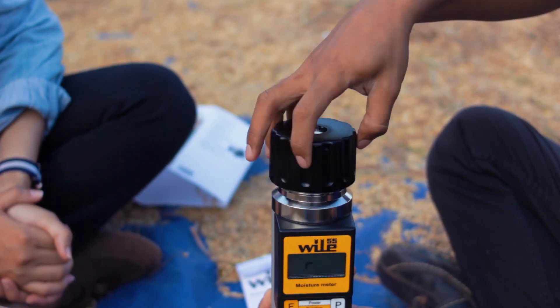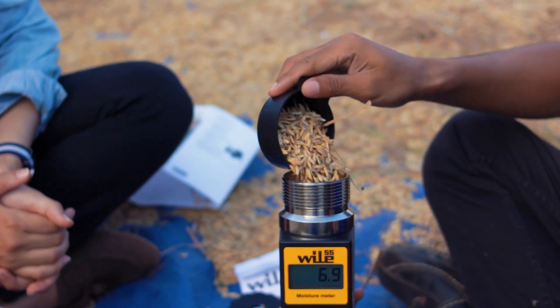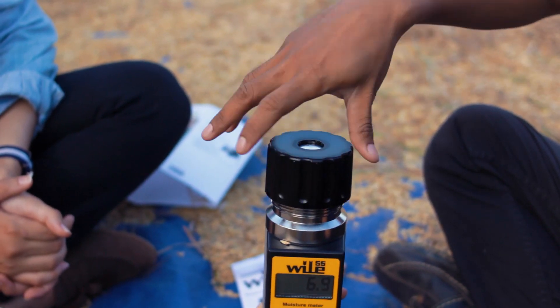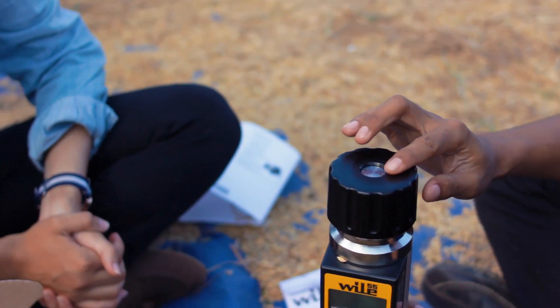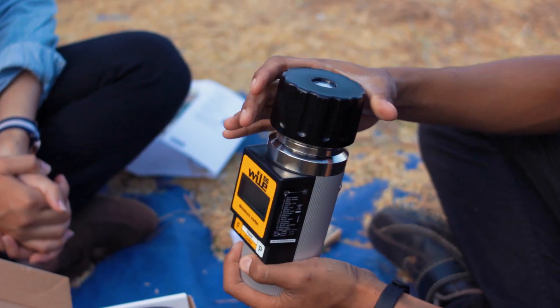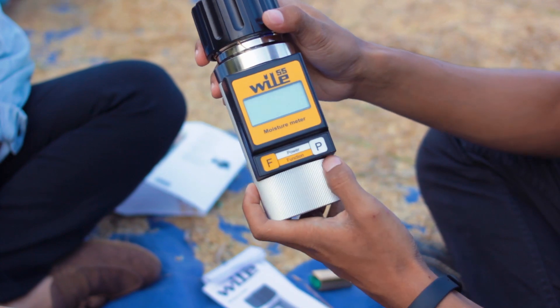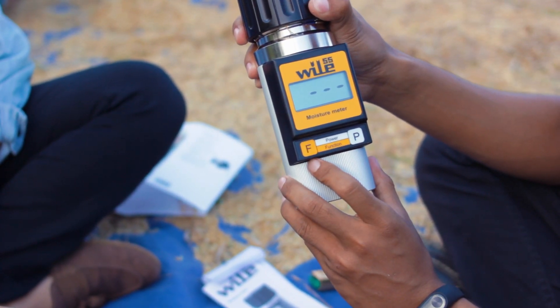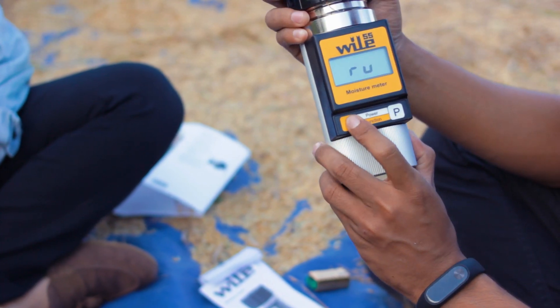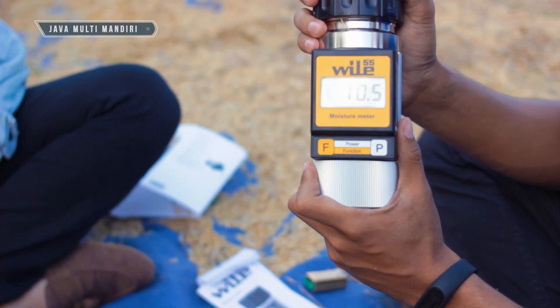Selanjutnya kita masukkan lagi sampelnya yang tidak penuh. Kemudian kita tutup kembali. Untuk pengukuran, lihat pada titik tengah ini — harus rata dengan titik hitam ini. Jika sudah rata, kemudian kita nyalakan alatnya. Caranya tekan tombol P. Kita gunakan kode yang di belakang — kode padi nomor empat. Ini sudah siap mulai pengujian. Untuk hasilnya: 10,5%.